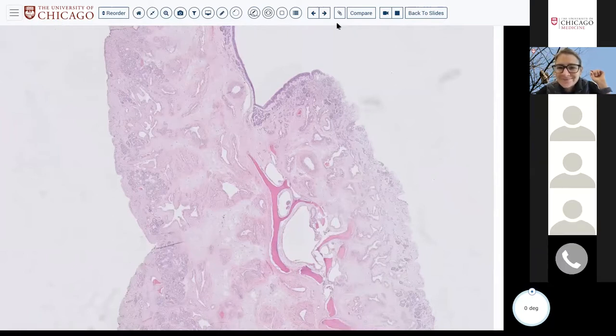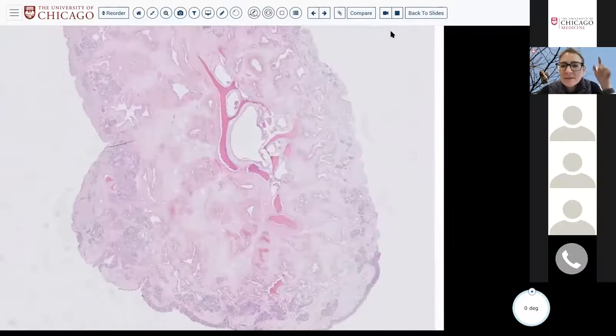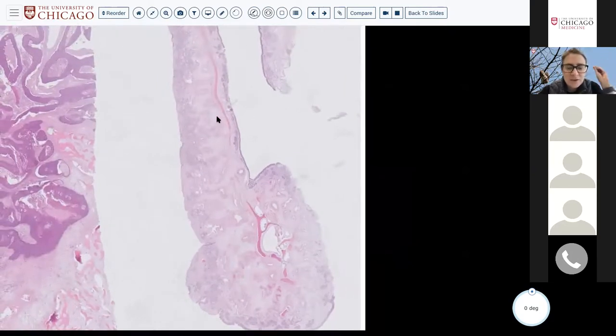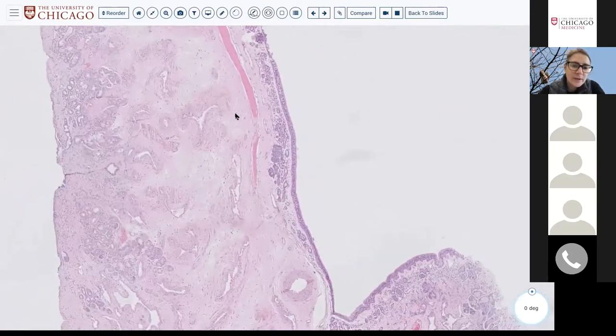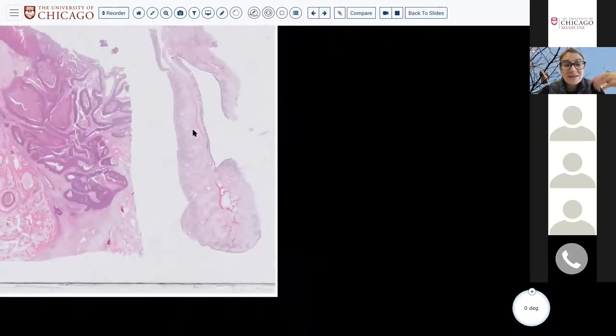Heather Smith put turbinate in the chat. Yes. Excellent. Thank you for saying that. For some reason it didn't pop up that there was a notification in the chat. Awesome. Turbinate. So when you see these thick-walled muscular vessels underneath respiratory epithelium, often with bone, this is turbinate. So this is an entire turbinate, right?